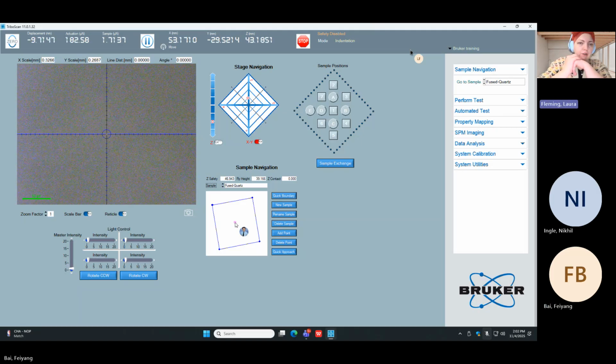Okay, we were all focused at this height across the sample earlier. We just have to trust it now, given that it's hard to judge based on this, because the sample is so transparent in these optics. So, okay. We did forget one thing. Do you remember that there was a pop-up after the H pattern, after we completed it, about a quick approach? Yes.